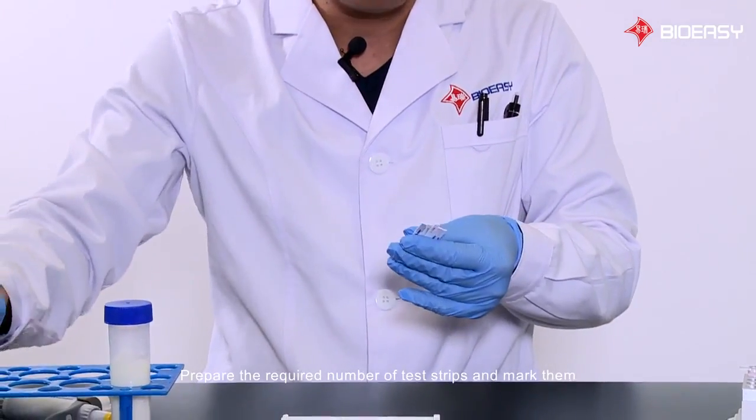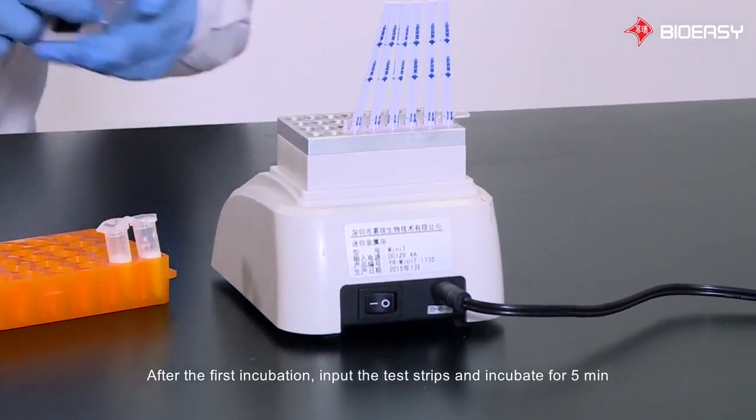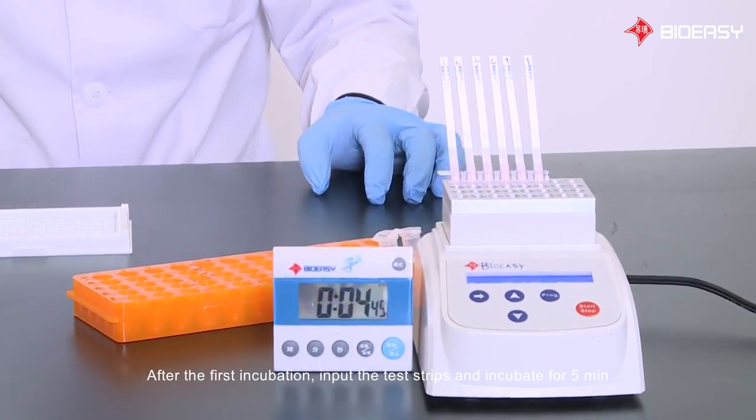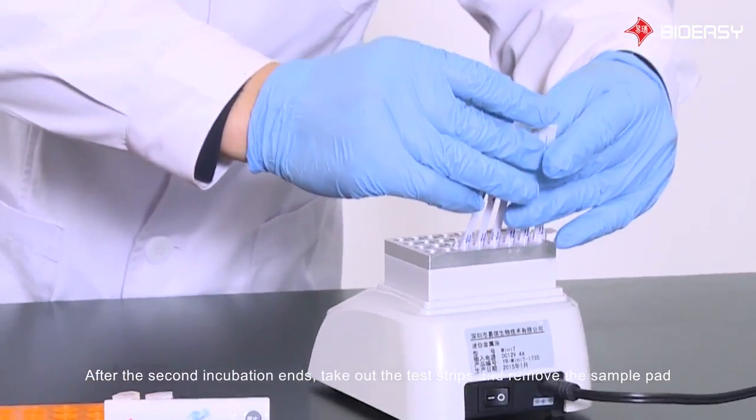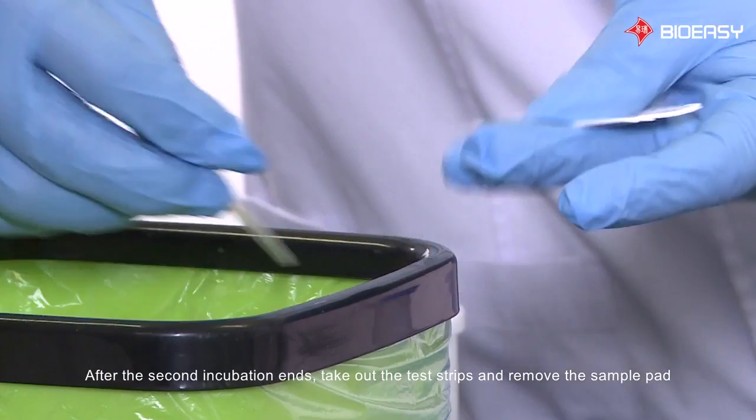Prepare the required number of test strips and mark them. After the first incubation, insert the test strips and incubate for 5 minutes. After the second incubation ends, take out the test strips and remove the sample pad.